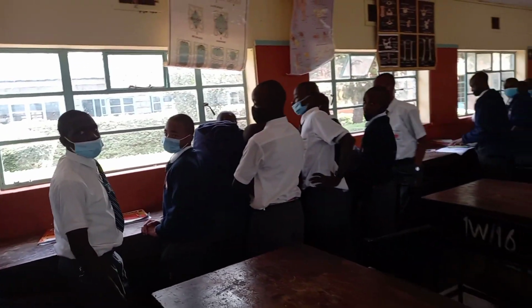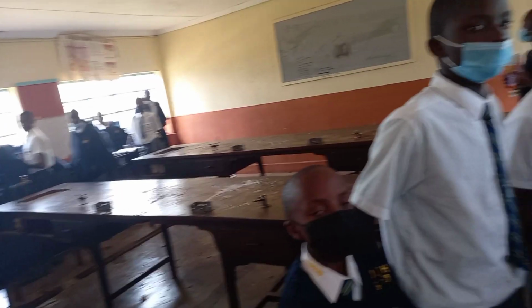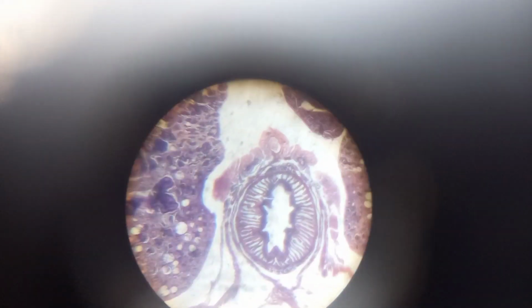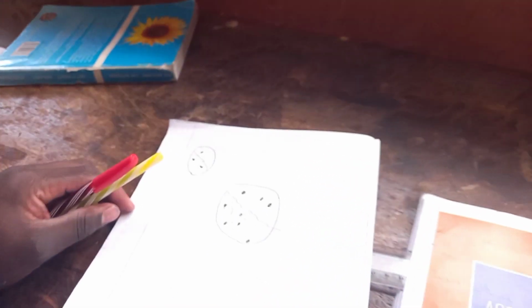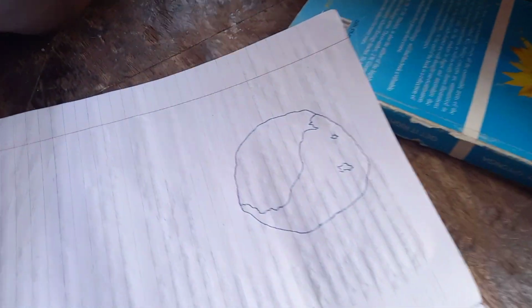How many see finer details, where it becomes even more clear? Group status so far. Others keep trying. Make a drawing of what you can see. That is what you can see using the low power. All right, at least your field of view is circular.